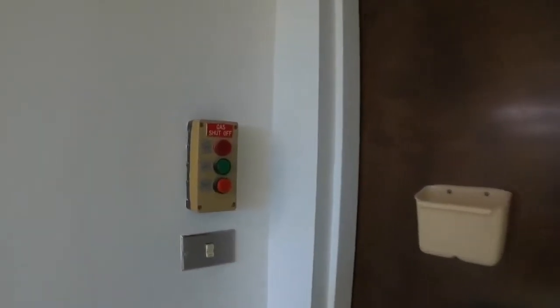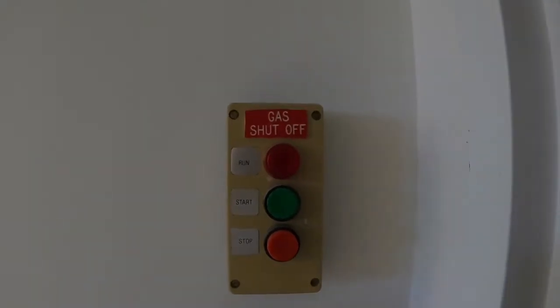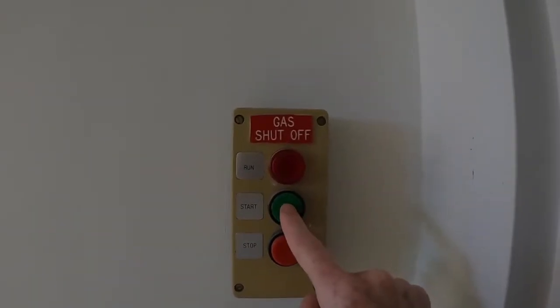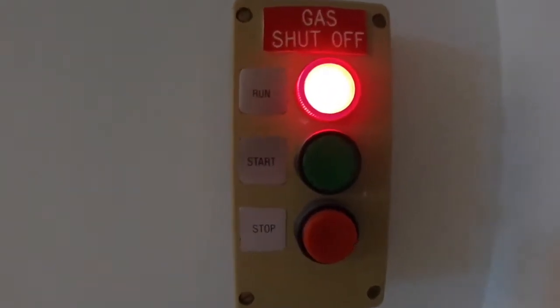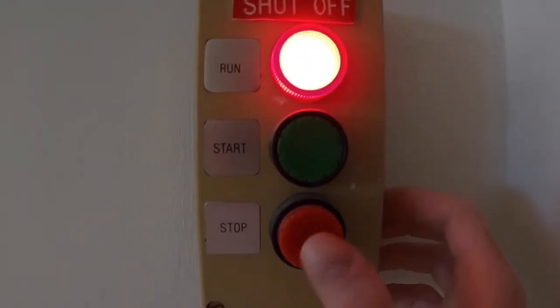Then as you leave the room, you should check the room's main gas valve. When the gas is on, the red light will be showing. To turn off the gas, you simply push the big red button labeled 'stop.'